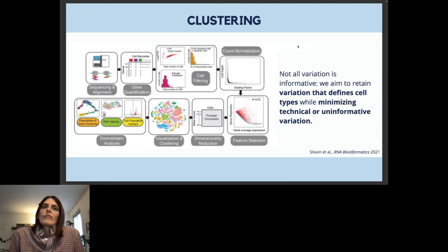So first of all, in order to obtain a pretty nice graph like this that you see in all publications with single cell analysis, we have to understand that this is a plot that is somehow capturing the variation in the transcripts of each cell type and each cell. So we can actually have many sources of variation that are not of interest, but that confound our data.